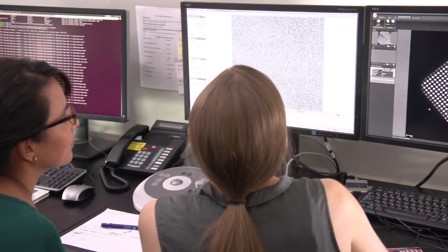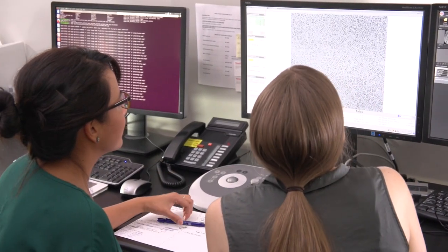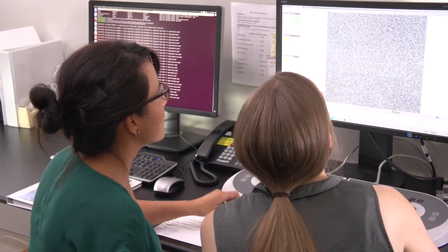My name is Mario Borna. I am the director of the Cryo-Electron Microscopy Facility here at NIEHS. We use electron microscopes to image complex biological molecules and combine the pictures to construct a three-dimensional map.